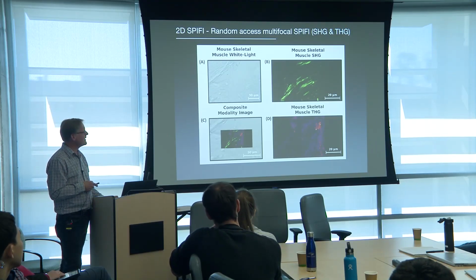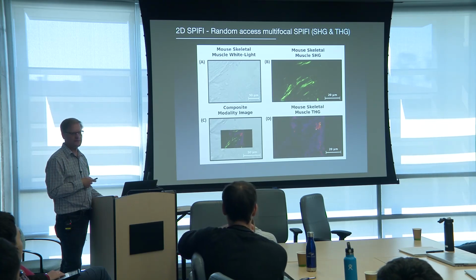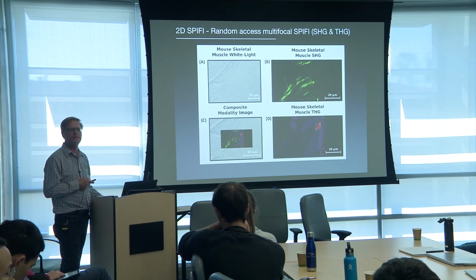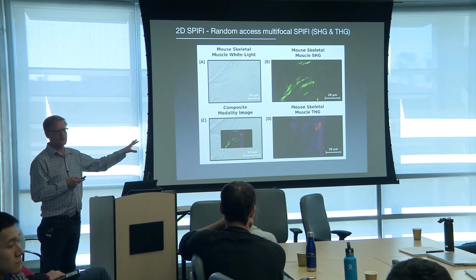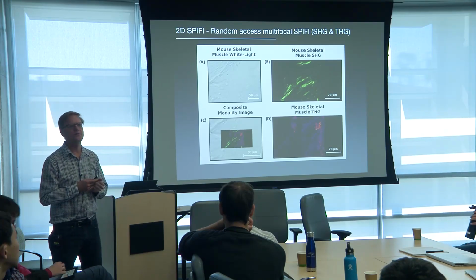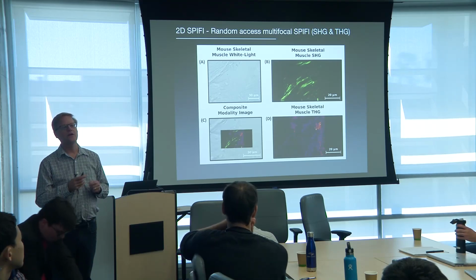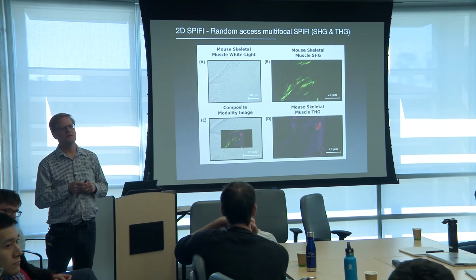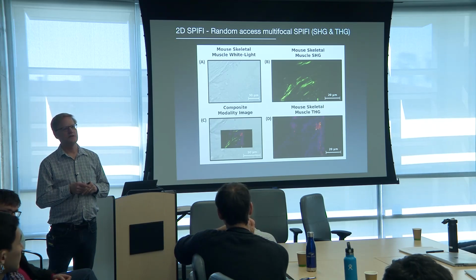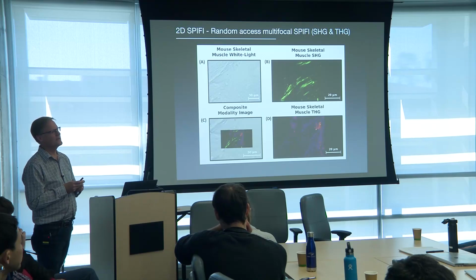Okay, so this one, again, we don't go super fast. We rotate the mask at about 400 hertz on this one. Yeah. So, any super resolution? There's no resolution enhancement in this one. Yeah. Oh, okay. I guess I'm circling back a little bit to this question then. But I'd expect them to require more photons in order to resolve finer details. Can you comment on the photon counts per pixel, or has that been quantified yet?